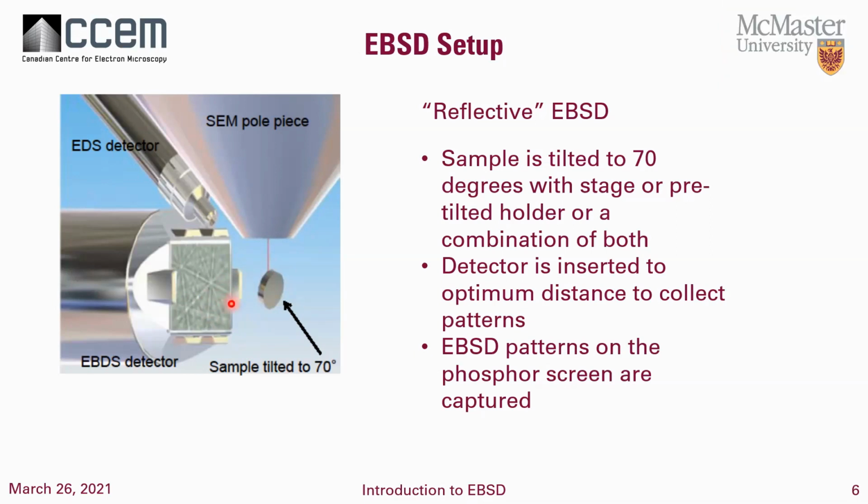You're probably a distance of maybe at most 10 millimeters away from the sample. So you're in pretty close because you want to get a lot of signal. The further out you are, you have effects on the area of the pattern you collect. But we want to get it in close so that we're collecting a relatively bright image. Otherwise, it's going to take us a long time to collect any substantial amount of data.